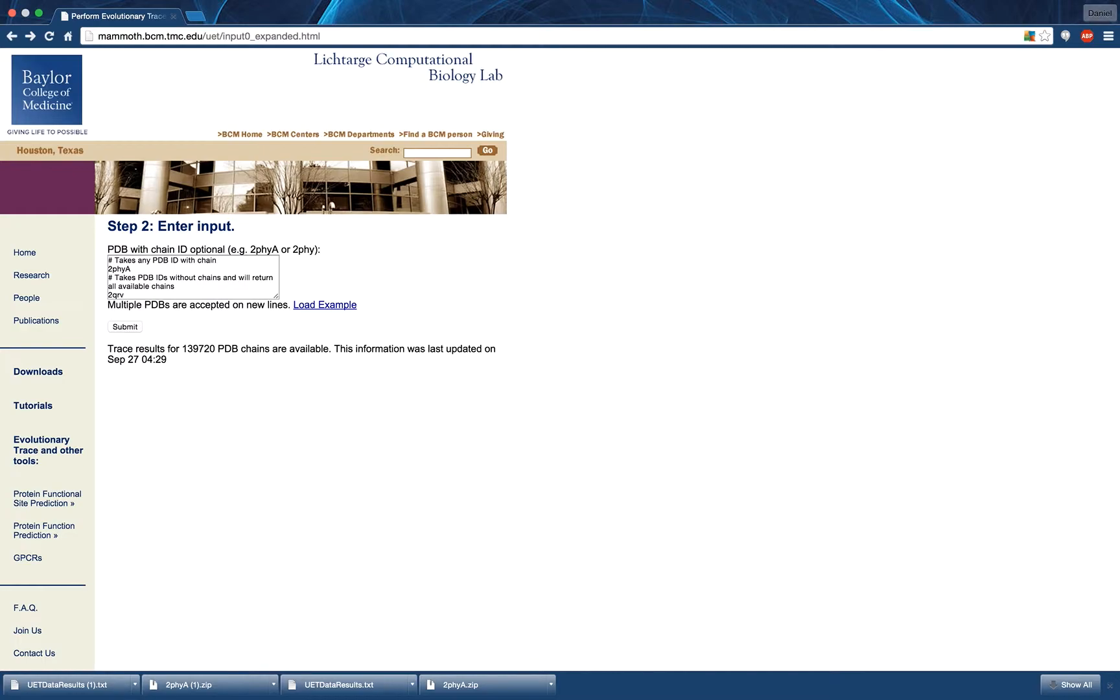If the PDB ID and chain identifier of interest are clicked instead, you will be taken to the relevant results page.